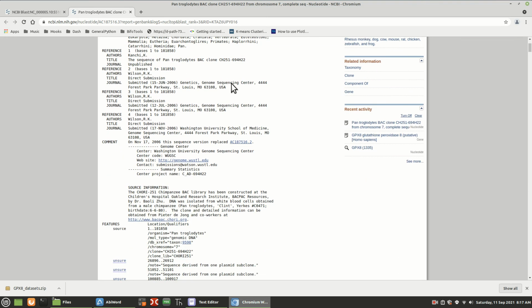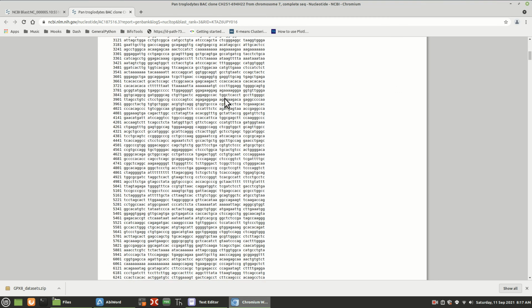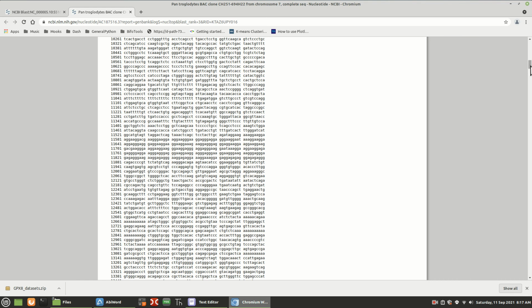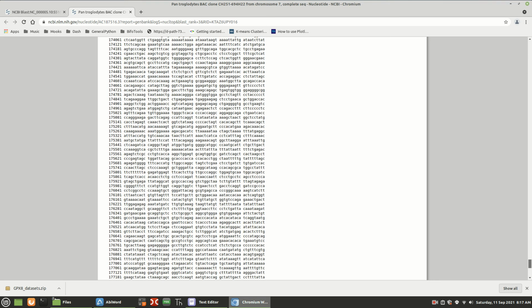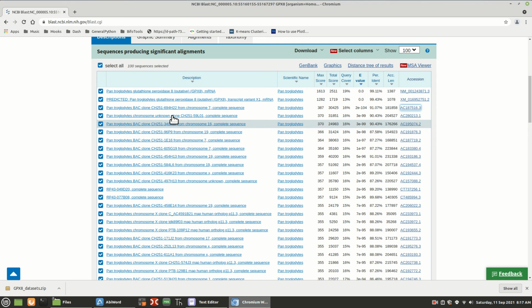Is it the complete chromosome? If it's a complete chromosome, it's too big. I think it's a large segment of the chromosome. I don't think it's the whole chromosome, but that's not what I want. That's too big. All right, so this is not what we want. All right, so I'm going to go ahead and use the RNA.